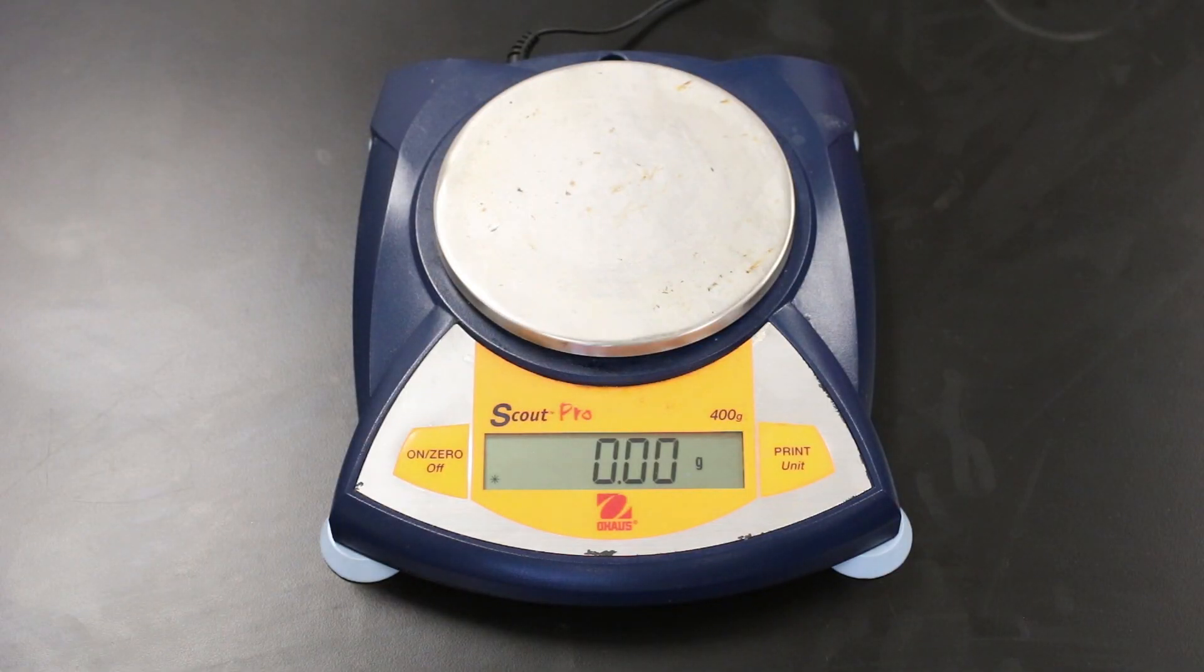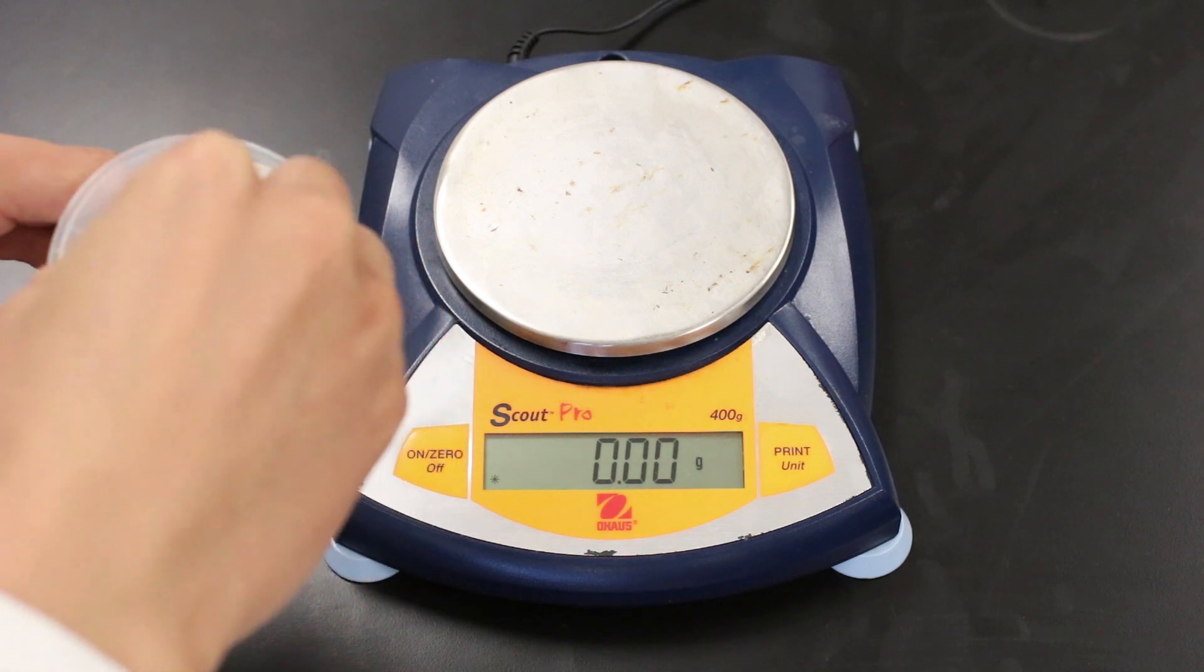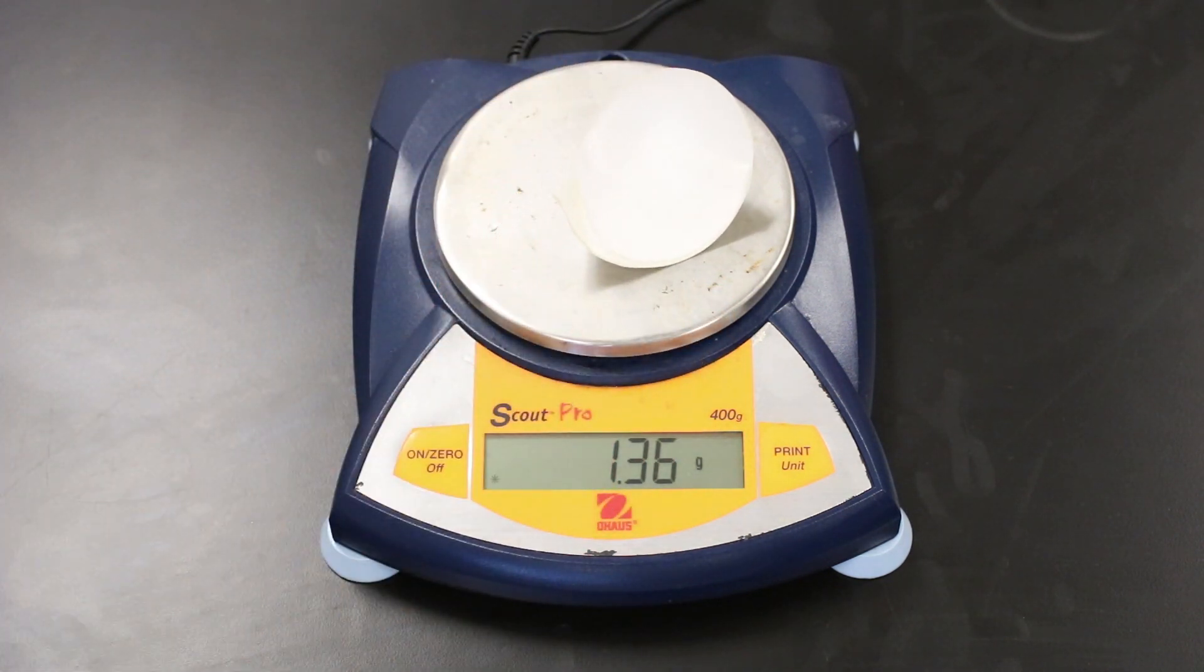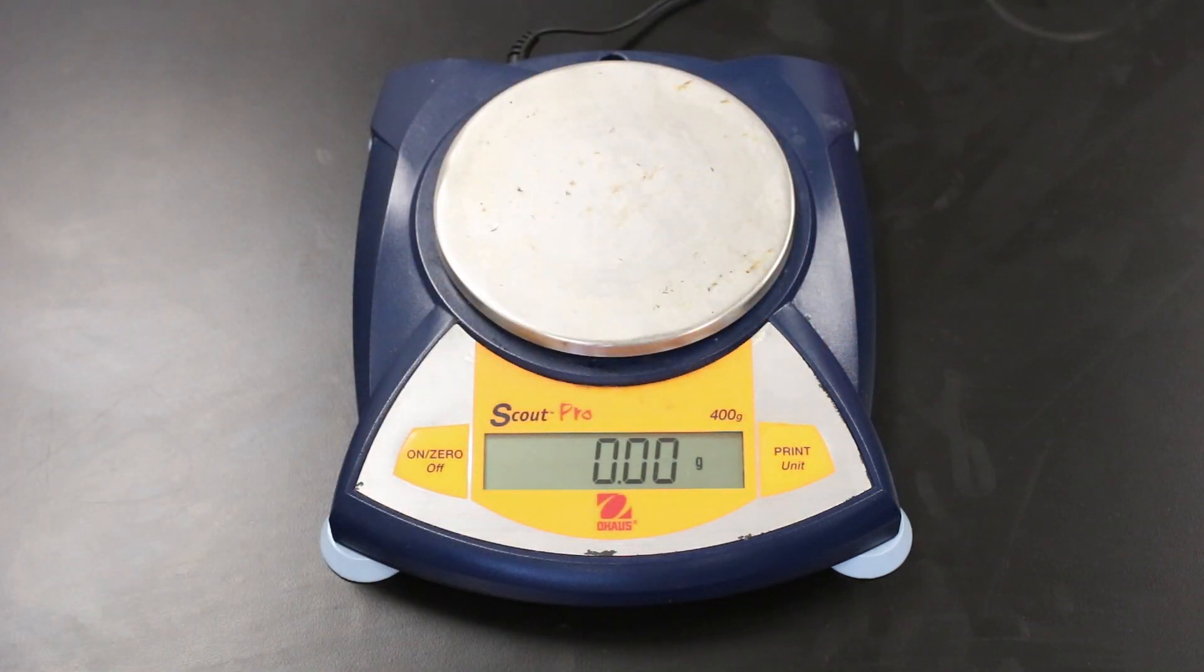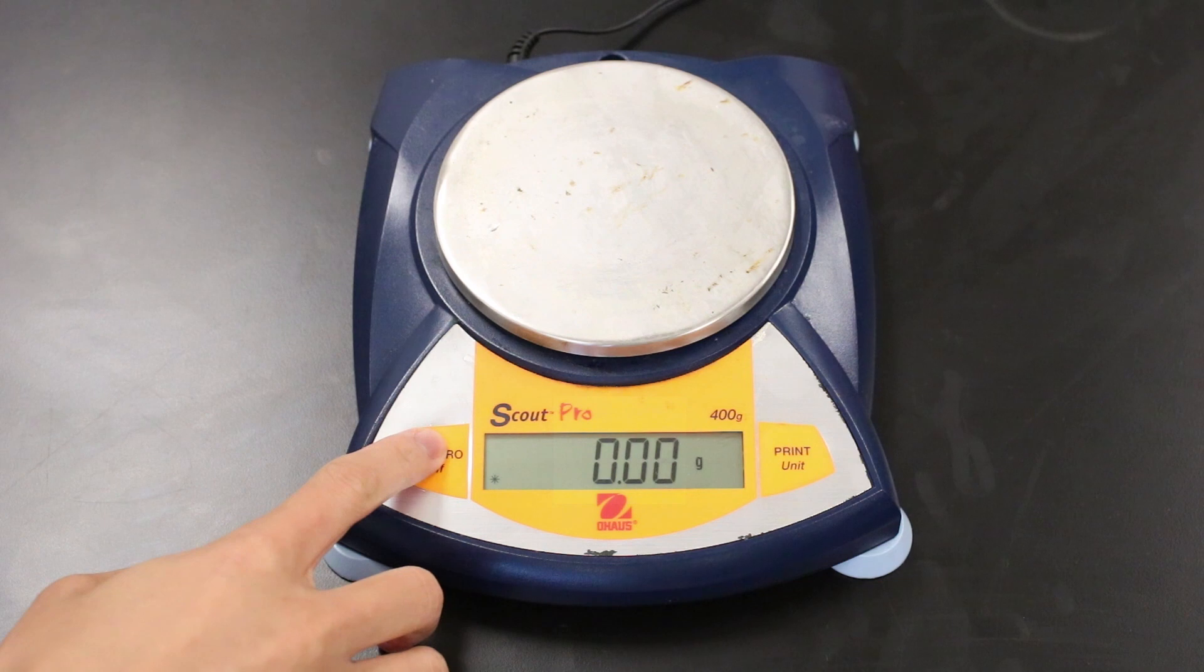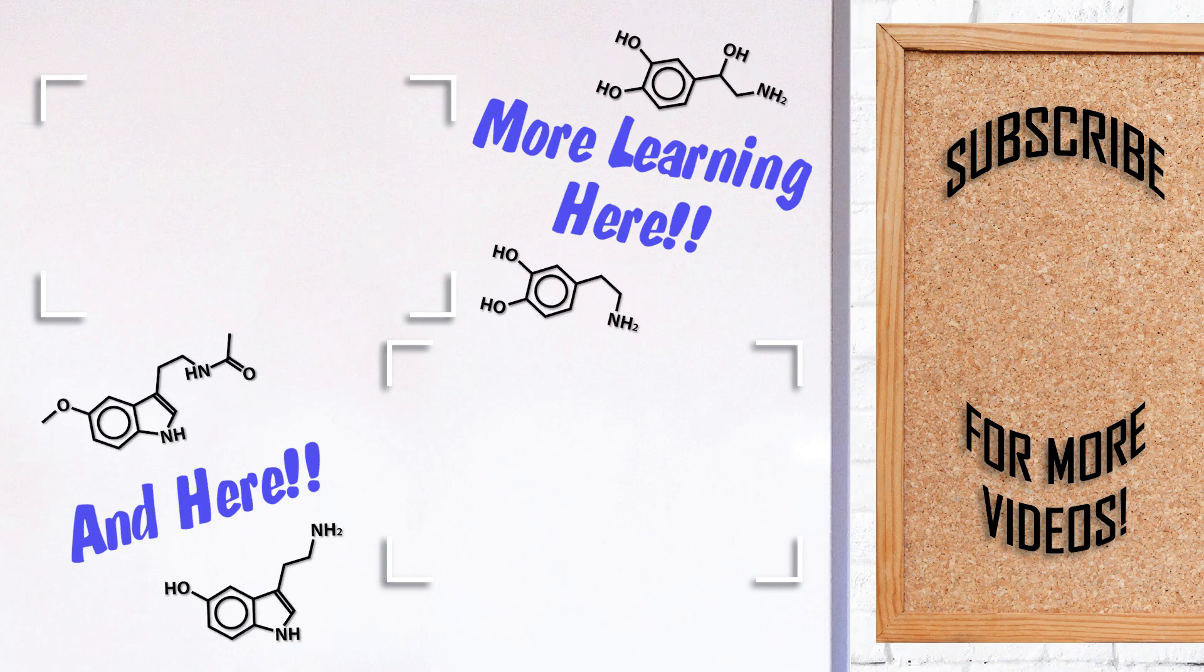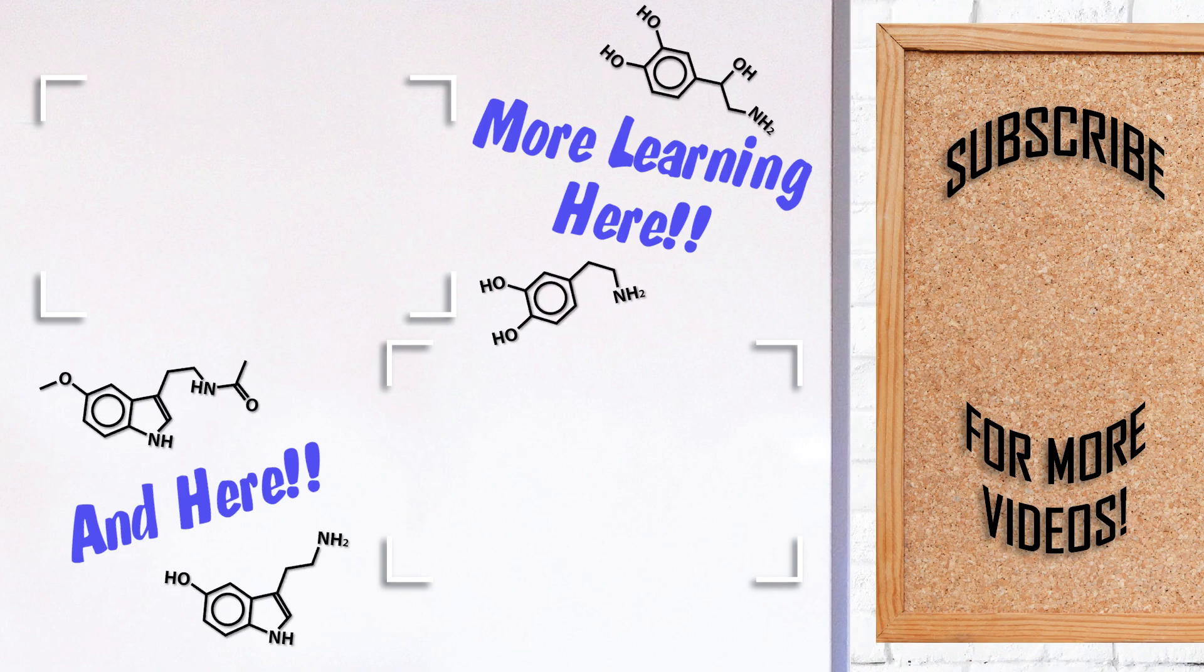Welcome back everyone, so all we have left to do now is to measure the mass of the precipitate. I'm actually going to measure the precipitate while it's still in the filter paper instead of trying to get all of it off and risk losing more. Alright, here's the final mass, and that's all you need to finish up your lab. Also, the filter paper is just a tad moist, so that's definitely worth noting. Best of luck. If you find that you need a little extra help, please feel free to check out my other videos for tips and tricks on how to succeed in school. And as always, thanks for learning with Lam.